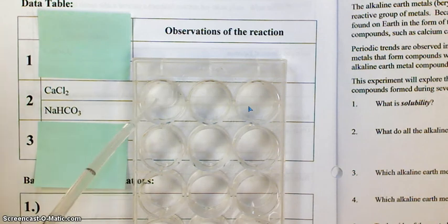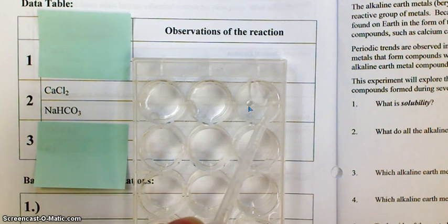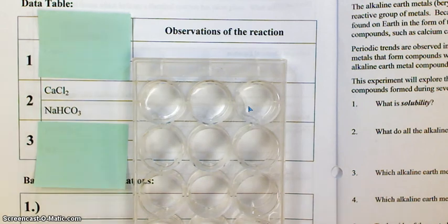It's kind of hard to see, but it is a clear solution. Okay, sodium bicarbonate solution right here. It is also a clear solution. Okay, and then I'm going to go ahead and add some in the third well of the spot plate.